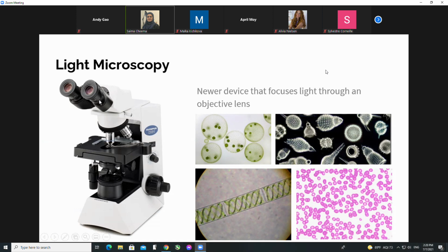So they individually can magnify 10 times, and then you can have multiple objective lenses on the nose piece. Depending upon the objective in place, you multiply the power of the objective with that of the ocular to get total magnification. Thank you so much for that. So that's how you calculate total magnification, and you should be able to manipulate that. If somebody gives you the total magnification and it's not given, you always assume the ocular is 10x, so you can calculate the magnification of the objective lens very easily.